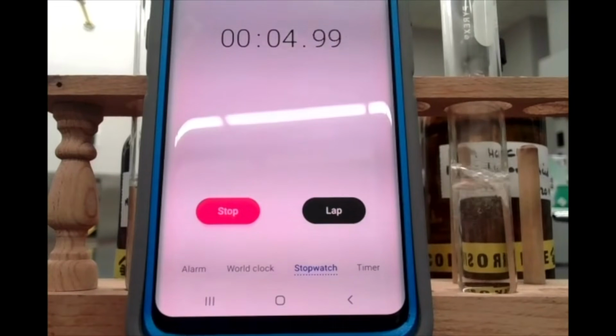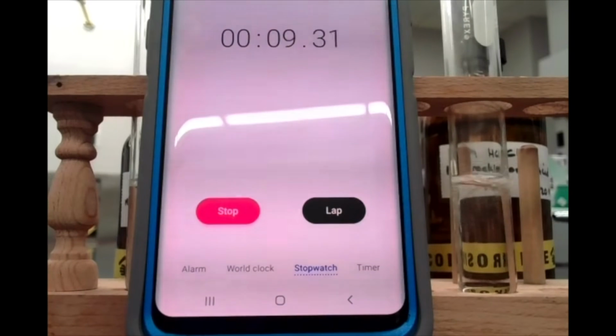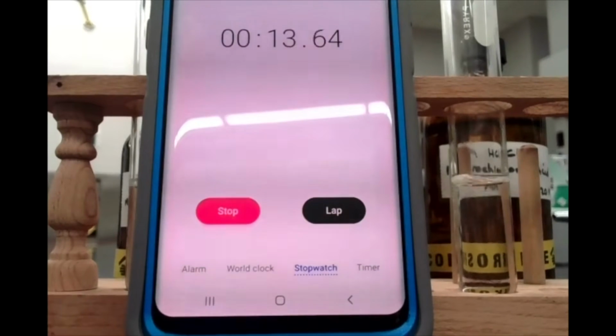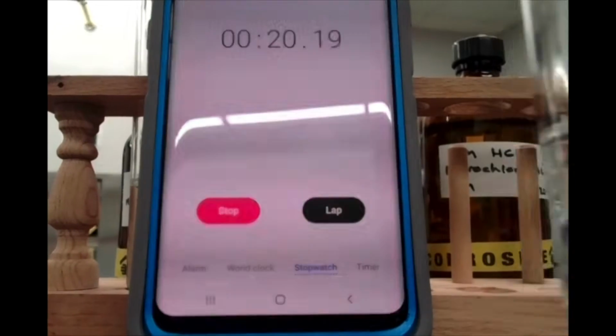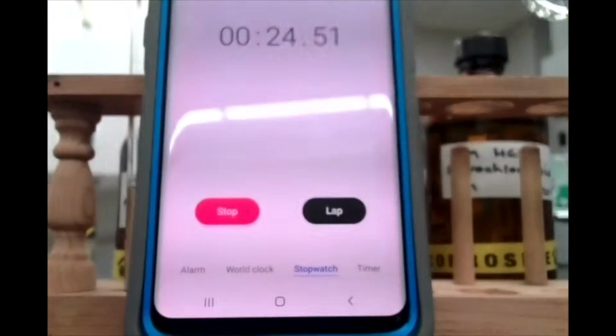So again, the speed at which the reaction occurs, the vigor, or those bubbles appearing, so that effervescence, is not the same thing as the time it takes for it to disappear, which hopefully you should have made a note of there. Okay, and that's it for that one.